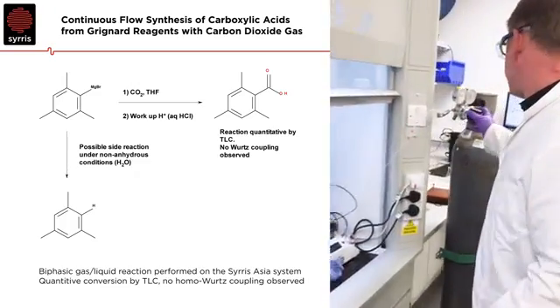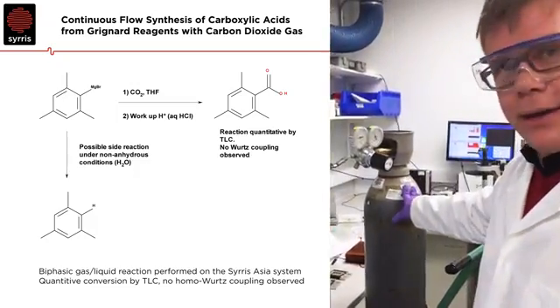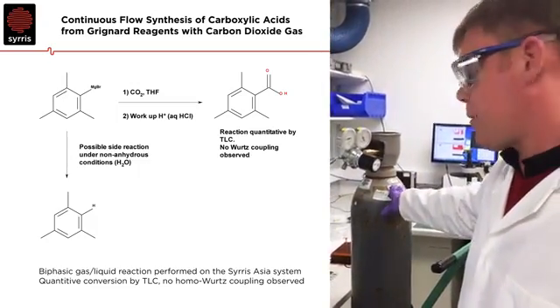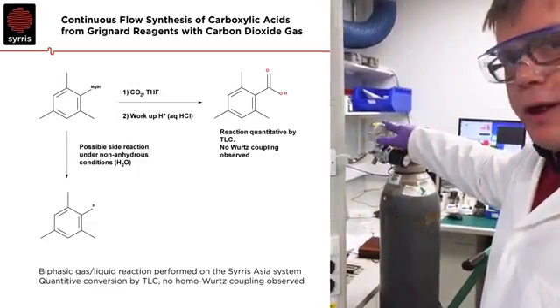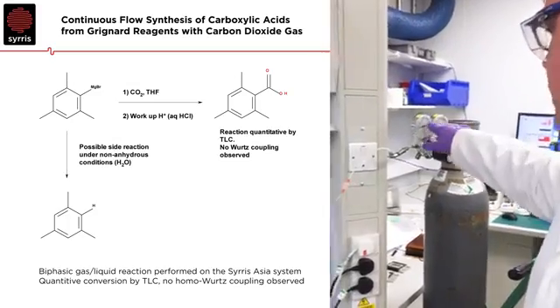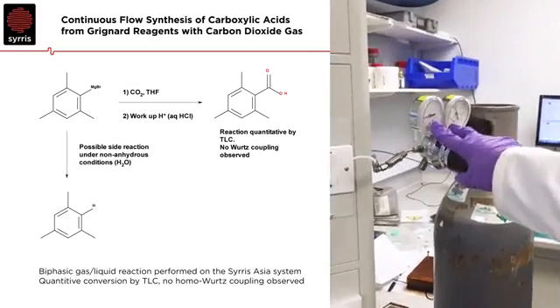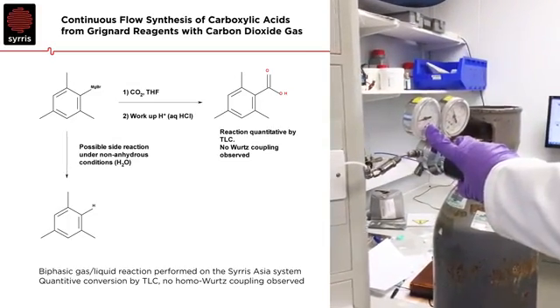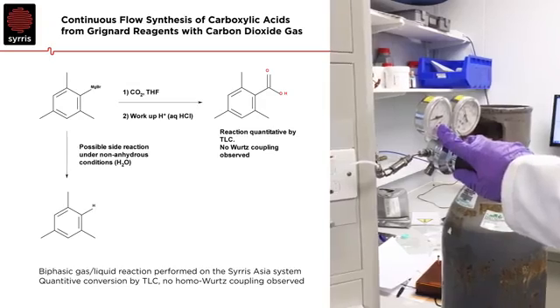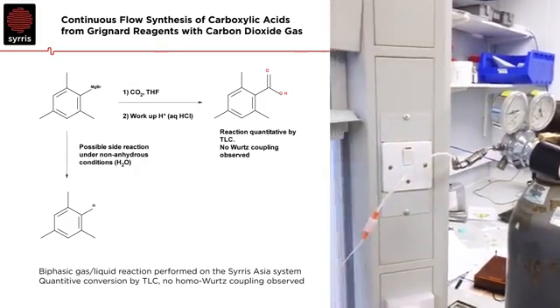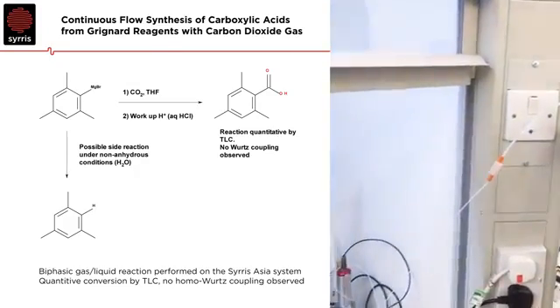You can see the setup we have here is directly from a carbon dioxide cylinder. We have a pressure regulator. This has quite fine control to allow us to control in detail with good resolution the differential between our system pressure and our gas pressure.